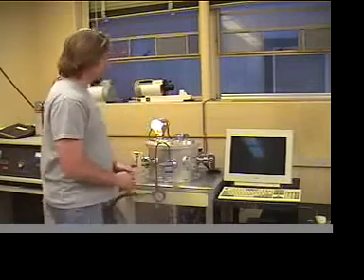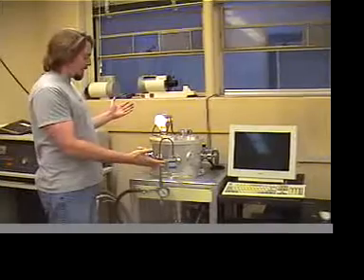Hello, and welcome to my introduction to the mass spectroscopy lab. This is our experimental apparatus you see right here.